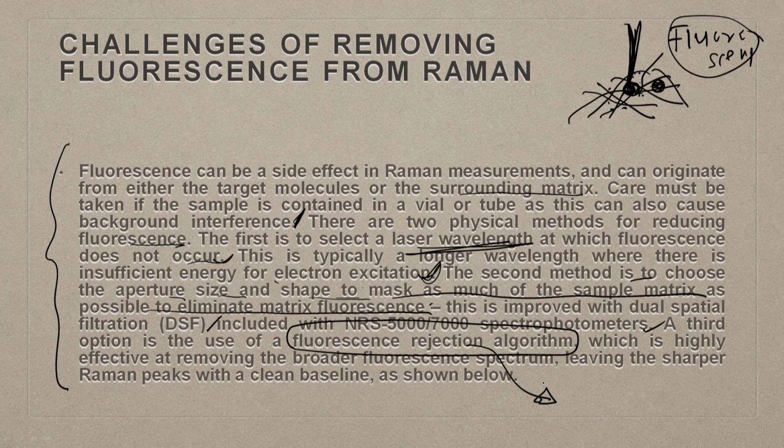But the problem with many of these algorithms is that everything is happening in the backend. You really do not know what you are getting rid of, because the person who writes the algorithm is writing it with certain baseline values, but that may not be your baseline, right?